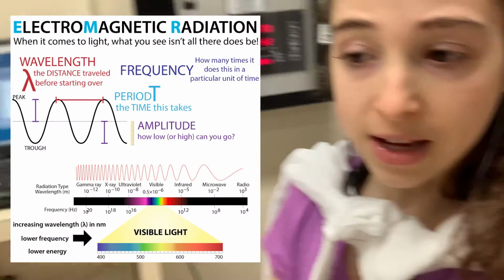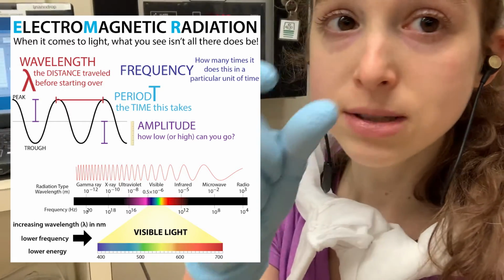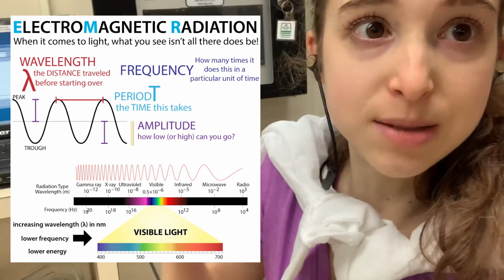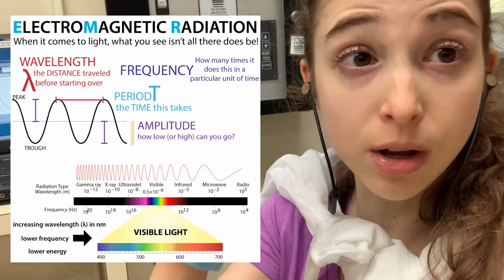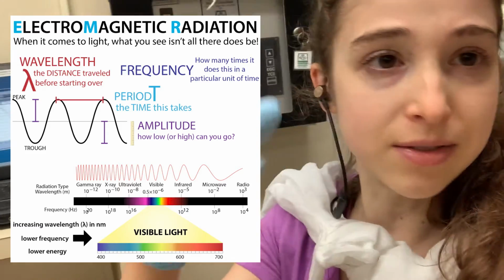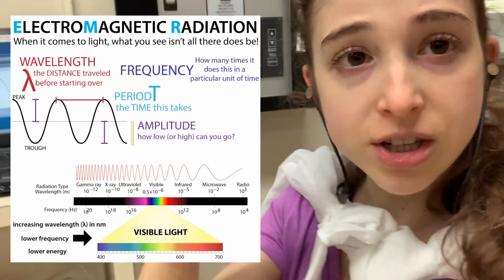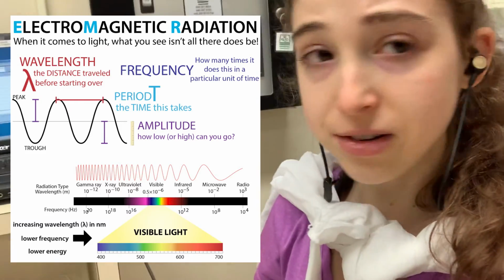So when we think about light, we typically think about visible light, but that's only a small portion of the electromagnetic spectrum, or what light is. So basically light is packets of energy called photons, and they travel in waves. And the more energy those photons have, the faster those waves will travel, so the higher the frequency.